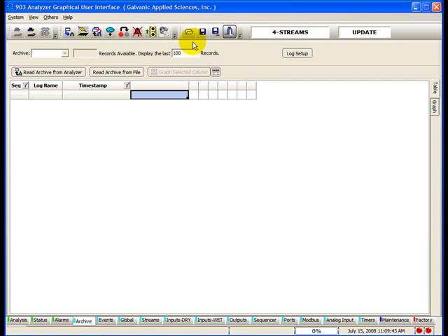The general toolbar contains buttons that allow the user to load and save configuration files, print configurations, and open the context selective help file. Open opens a saved 903 configuration file. Save current configuration saves current configuration to a file. If the configuration has been saved to a file previously, pressing this will overwrite the existing configuration file.